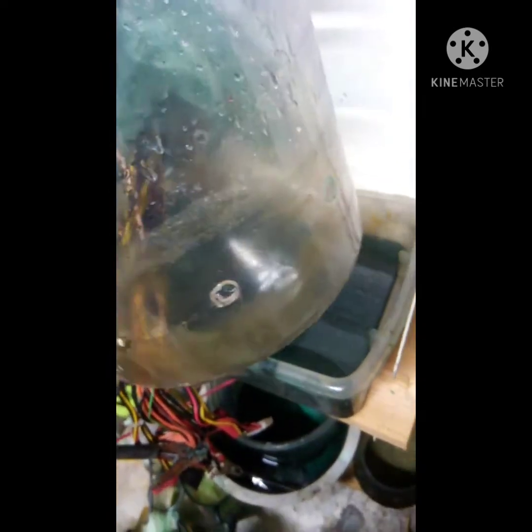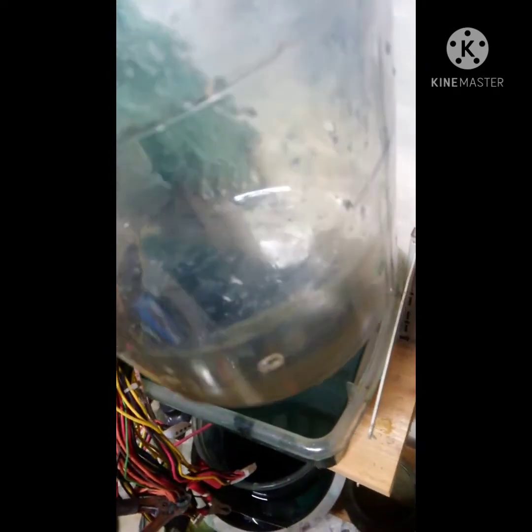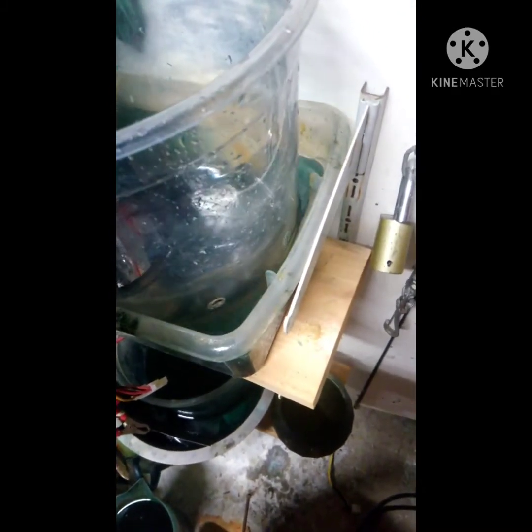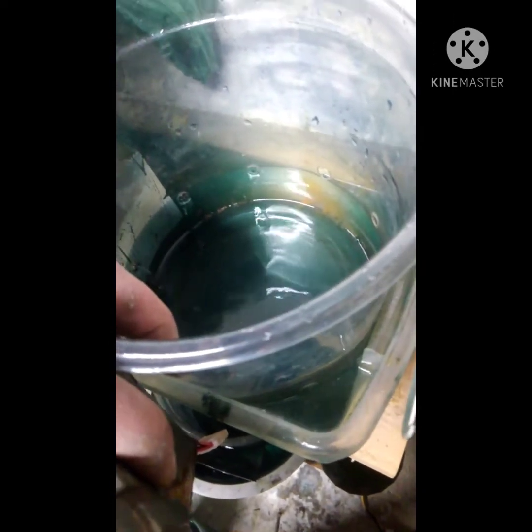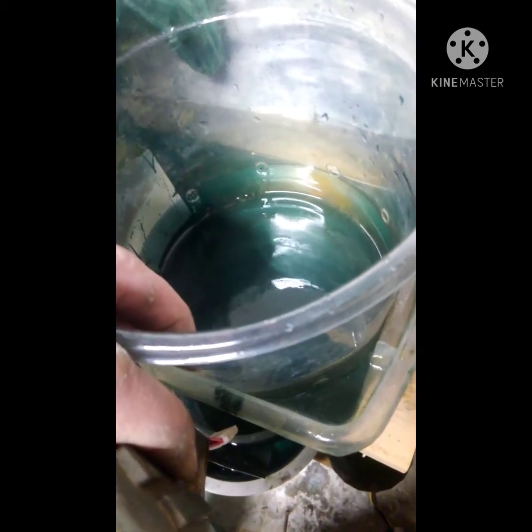I've got one container here and another container with holes drilled in it. I drilled holes full circumference in this — do not do that. Only drill holes in half of it, on one side and not the other. Push this down into the liquid. You don't want the holes to be above the water, close to the surface, or close to the bottom either.